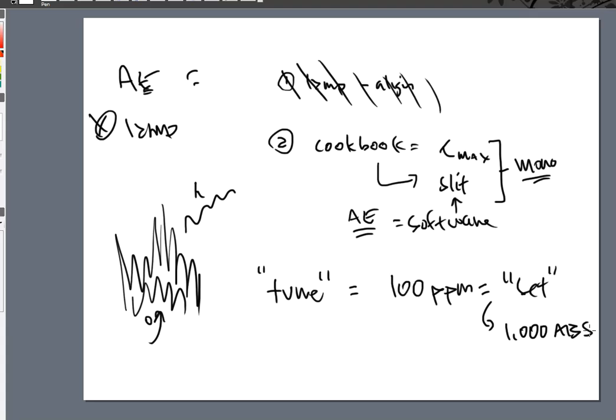So it's a comparison, right? So if this is my 100 ppm, and if I'm pumping that 100 ppm through the flame and the detector sees it, we don't want to overwhelm the detector. So what it does is that it looks at the signal that it sees and it adjusts itself. It will scale itself up or it will scale itself down in order for that standard to read a 1 absorbance. All right, so that's very important.